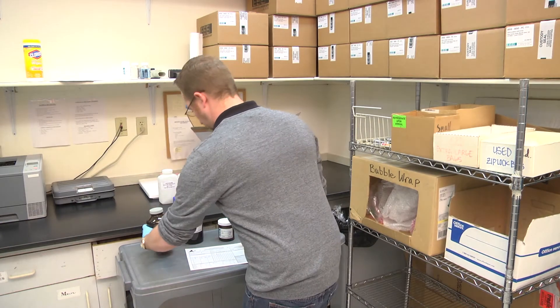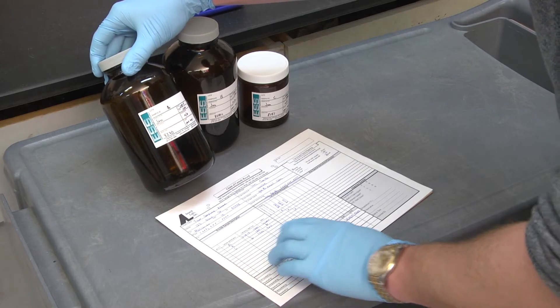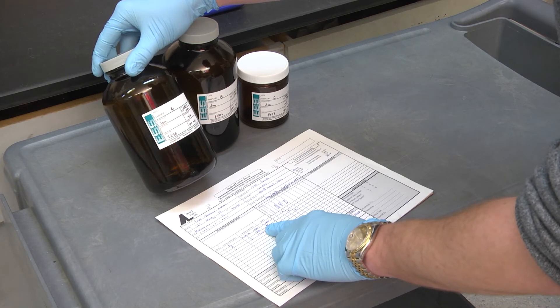Before packing your cooler, make certain that all samples are clearly labeled and that they all agree with the chain of custody and that all required analyses are noted on the chain of custody.